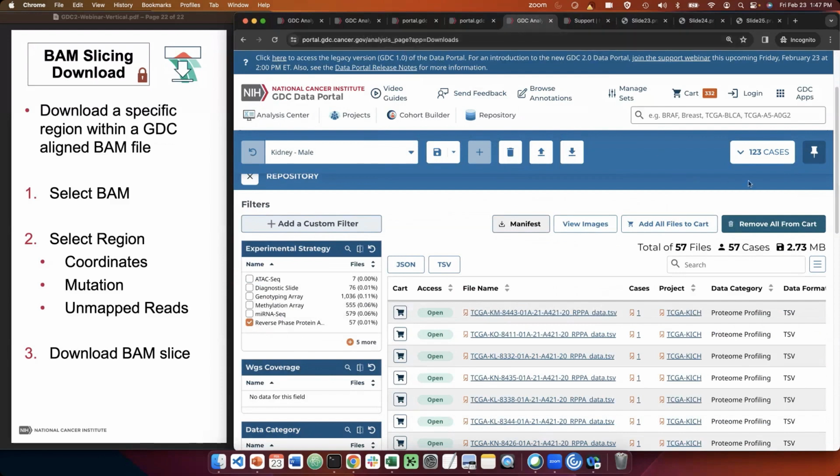Okay, and the next question is, are there any changes to the GDC BioLinks R package? So you'll have to ask the TCGA BioLinks group; they are not affiliated with the GDC directly. They use our API and sometimes contact us with questions, but I just want to mention we are not affiliated with them, so I'd recommend reaching out to them with any questions you have and for any support with TCGA BioLinks.